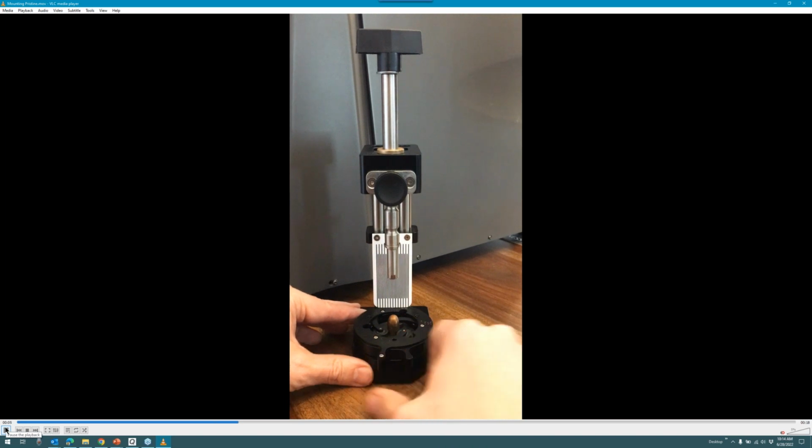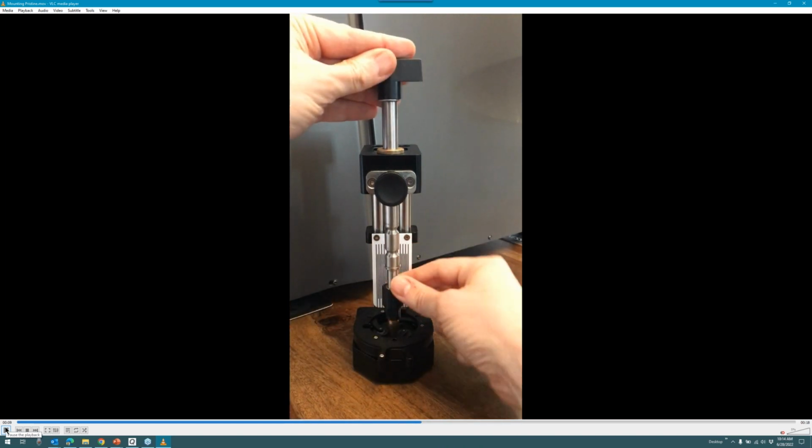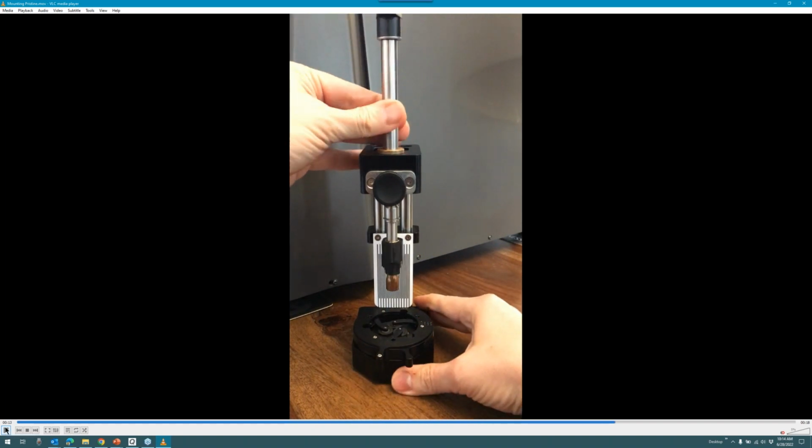Bullet is mounted and centered. Stub is placed in the shaft. That is pressed into the nose of the stub, of the nose of the bullet rather. And you can give this a twist now and see with the backdrop there that there is minimal to no wobble, and that is ready to go. That was about 25 seconds as well, I believe.